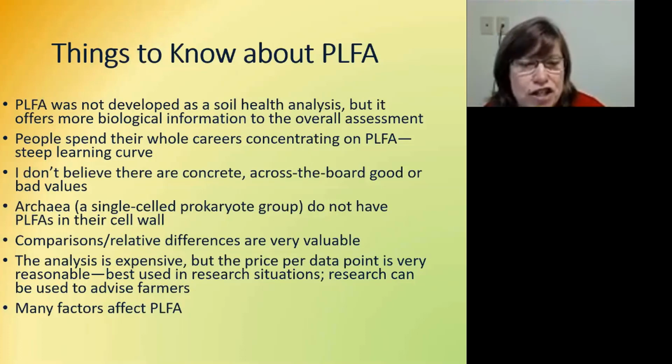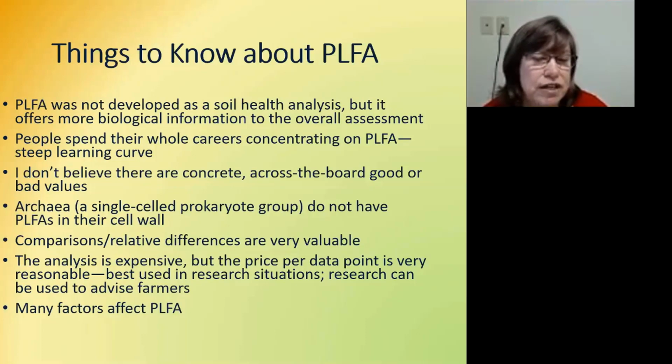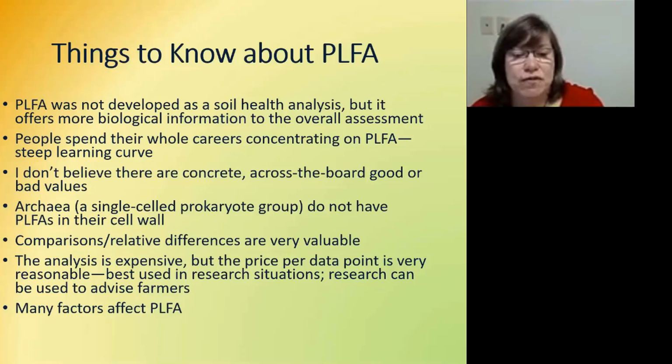There are some microbes that do not have PLFAs in their cell wall, so Archaea will not be included in this. I think at this point, comparisons and relative difference are what's valuable, so make comparisons. We don't usually suggest that farmers get this analysis because it is expensive and it's difficult to explain just a single PLFA sample without some sort of comparison or other background information. But for researchers, think how many data points you're getting with this analysis for the price. I think it's hard to find another analysis that's going to give you as much different information that you can use.